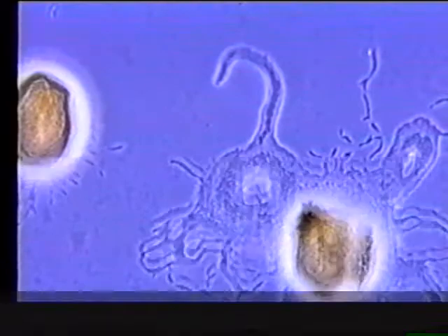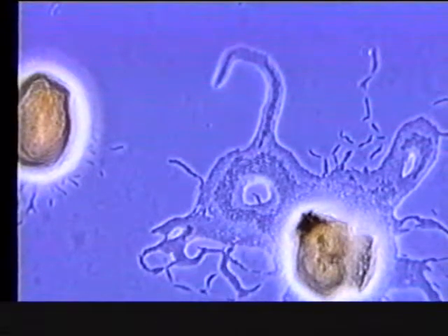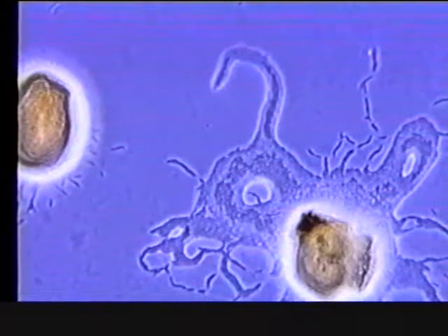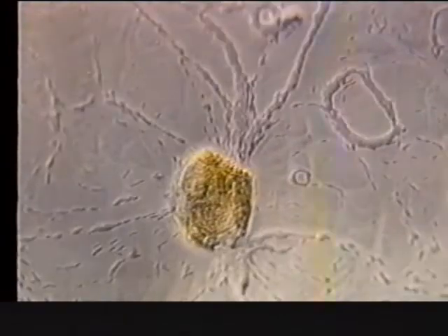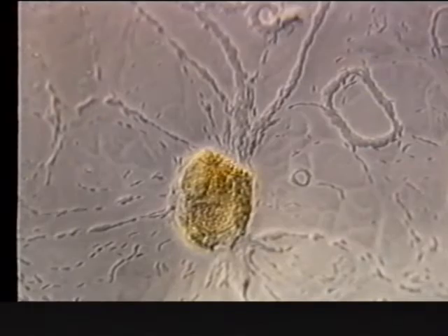You can see there are actually two sporangioles that were germinating, and from each one, a swarm comes out. In this particular scene, you can see these light lines in between the cells. It's a better view. These are called slime trails. The myxobacteria make these slime trails while they're gliding, and they glide in the trails.